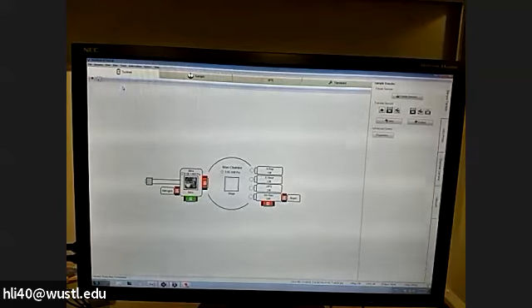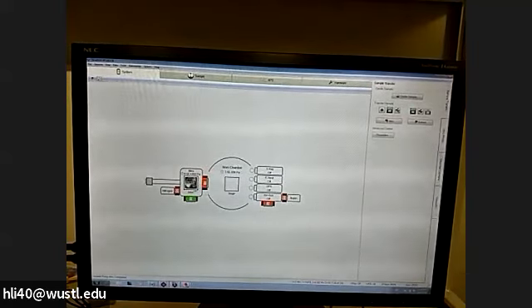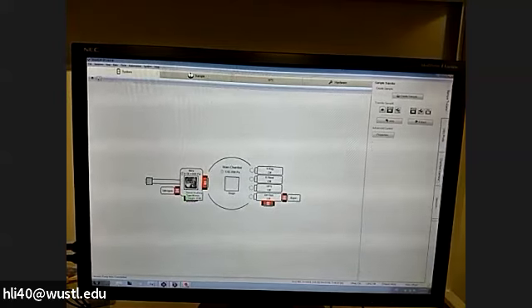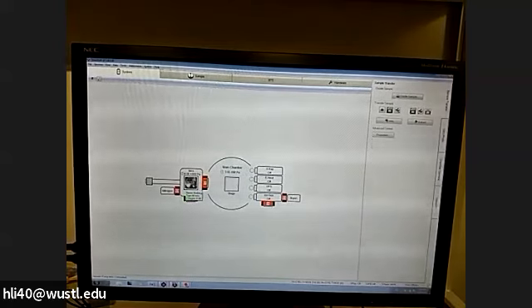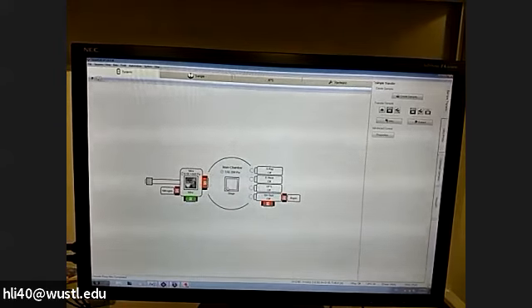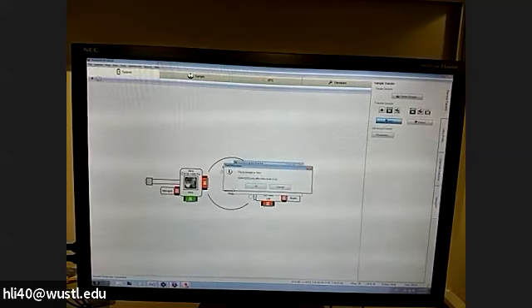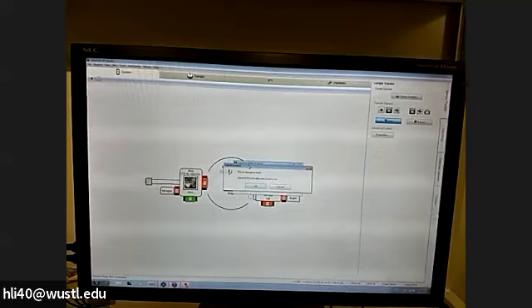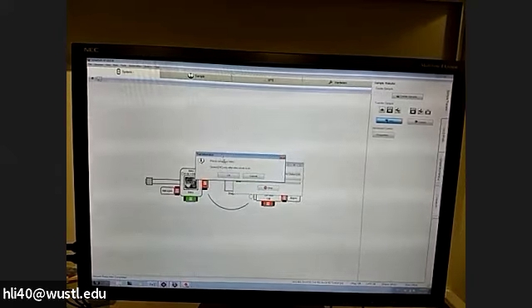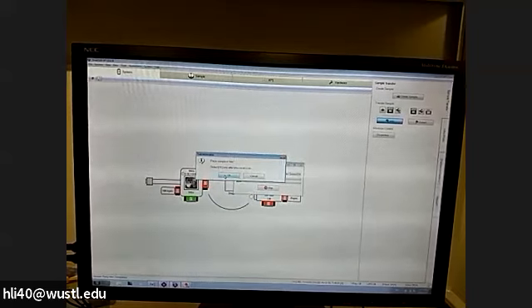Okay, so you make sure you're in the system tab. The next thing you need to do is just left click on the image and hold the left key. Then drag this image from the intro chamber to the stage. Then just release it. It will pop up the window to ask you to place a sample in the intro. We did that already. Just click OK.